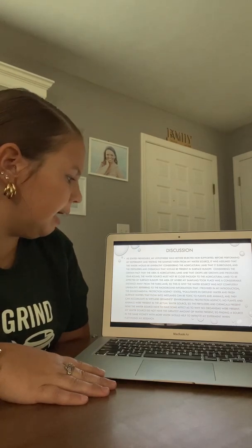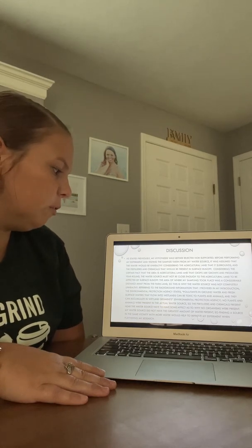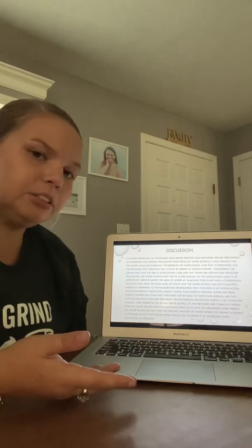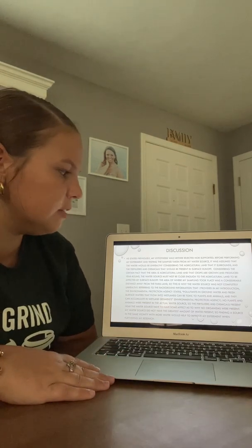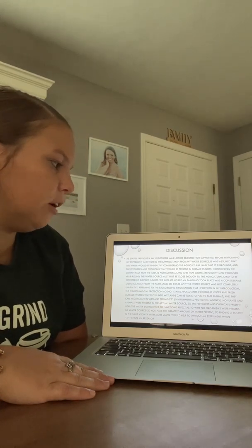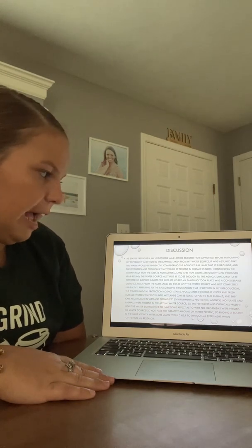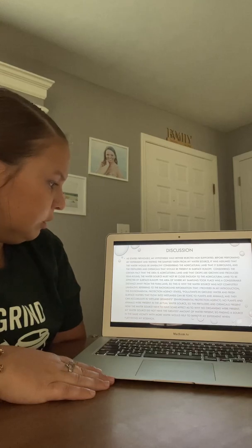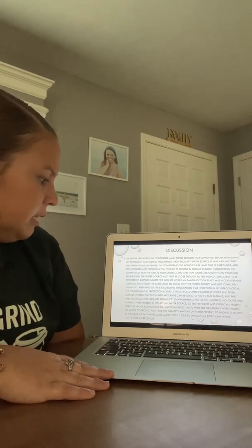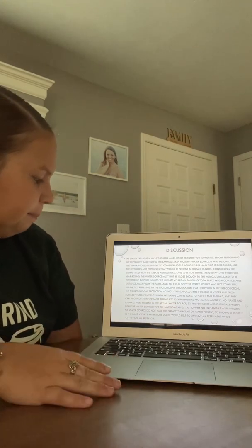Before performing my experiment and testing the samples taken from my water source, it was assumed that the water would be unhealthy considering the agricultural land that it surrounds and the fertilizers and chemicals that would possibly be present in surface runoff. Considering the certain fact that the area is agricultural land and crops are grown and produced year-round, the water source must not be close enough to the agricultural land to be affected by surface runoff. The area of where my sampling took place was a considerable distance away from the farmland, so this is why the water source was not completely unhealthy.